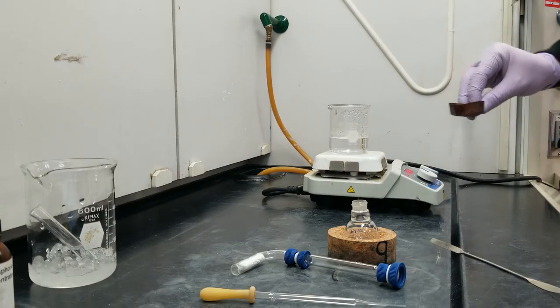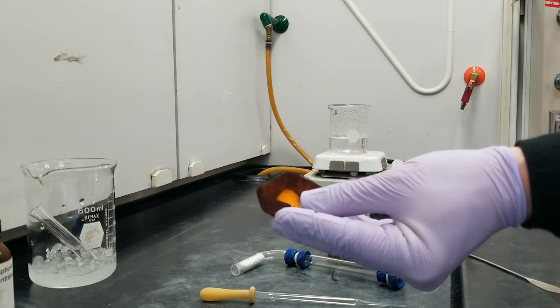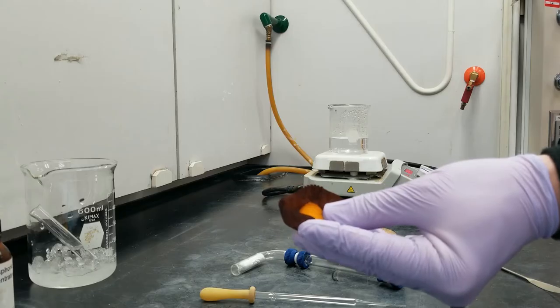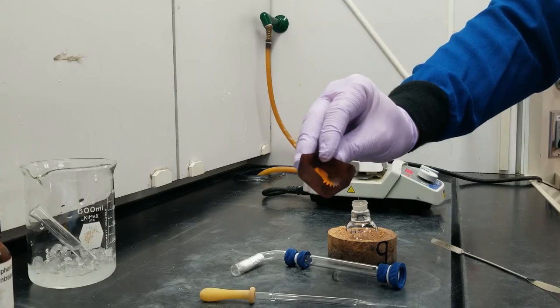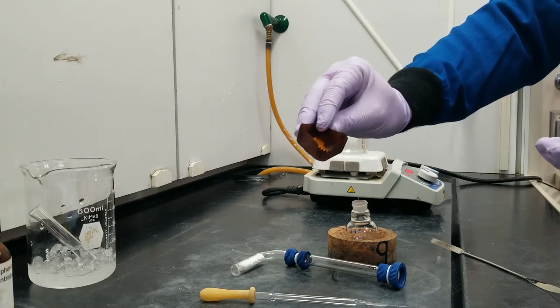Now, really quickly, our ferrocene looks like this. This bright orange powder is an organometallic compound. It's got an iron sandwiched between 2 cyclopentadienyl rings. What that means is that it's got 2 aromatic systems with a high buildup of negative charge.